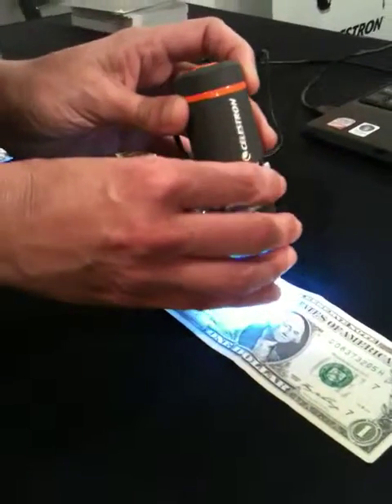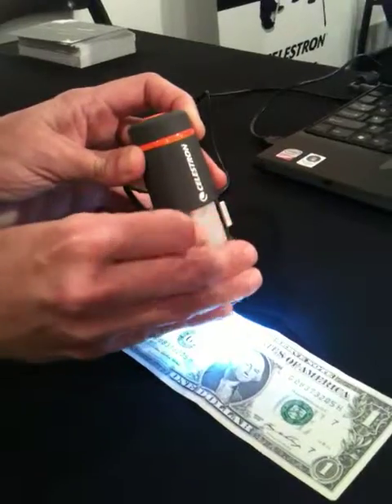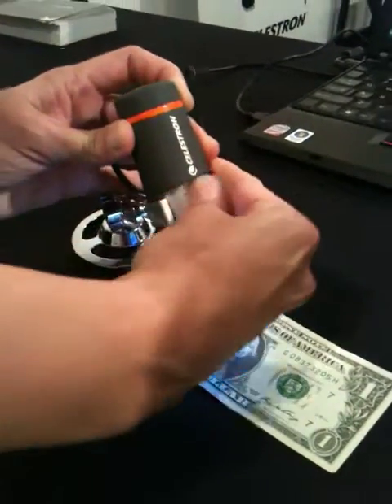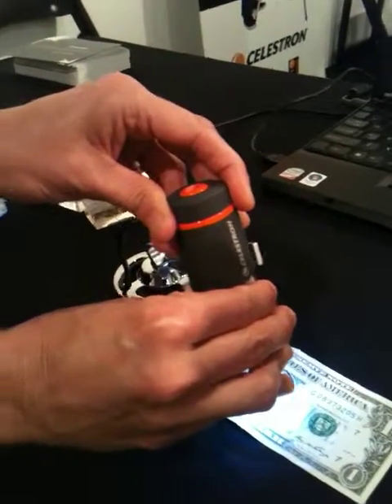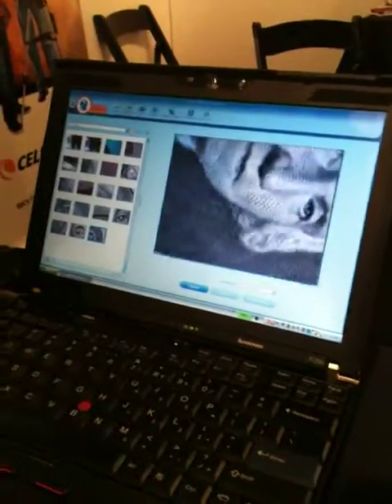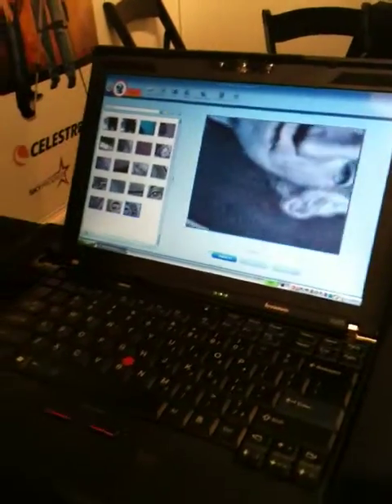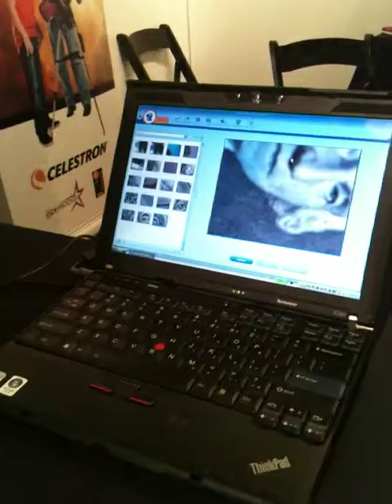And then we also have this handheld microscope here. It powers through your computer. It comes with a stand. You can also take quick snapshots with this one. This one goes up to 150 times power. You're using it there and it's showing on the computer screen — yeah, you can look at it right on the computer screen. And this one, you just snap the button on the top and it saves the picture right to the computer screen.